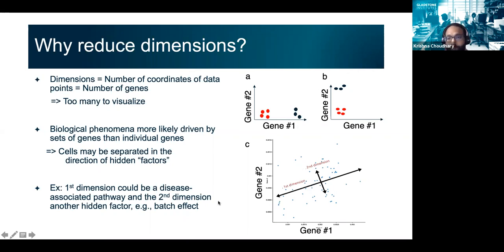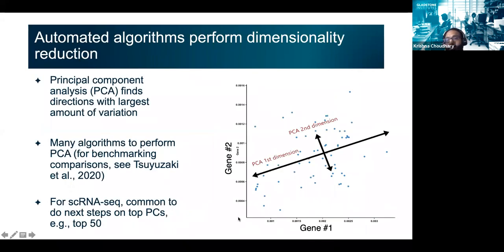That's all good. So in any case, what we want to do is ascertain if there are these directions or hidden factors present in our data, because they may also serve as a quality control. Maybe their presence indicates that there is something worth proceeding for. If they are not there, well, then maybe you need to redo the experiment instead of doing any analysis further. So that's what we want to do, and I will explain it in more slides.